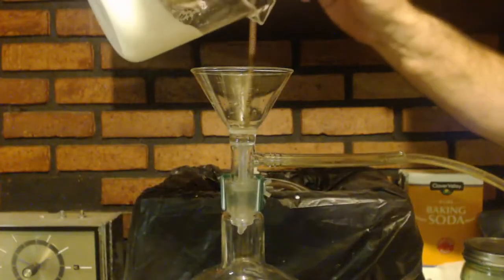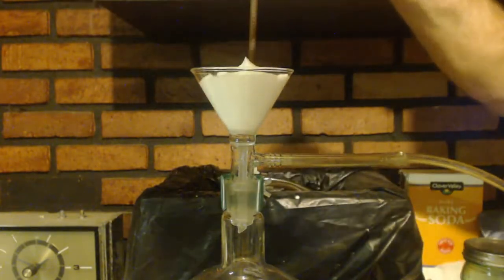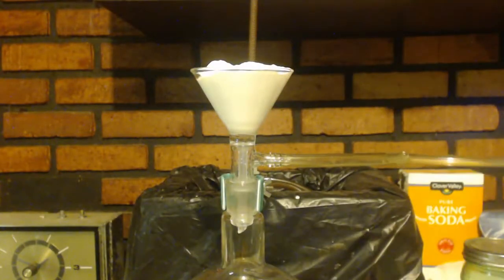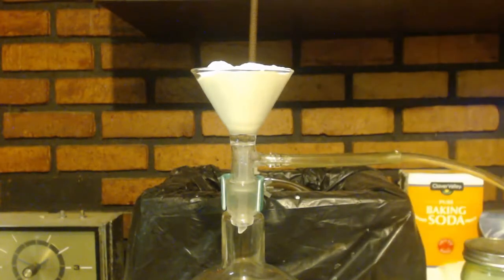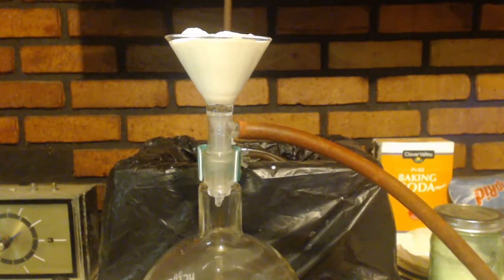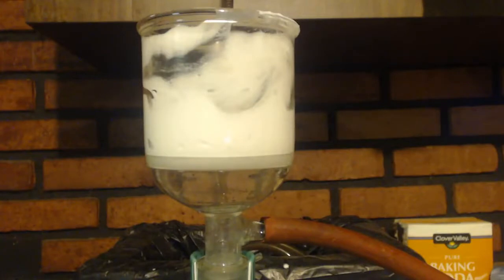So I'm just going to filter this out. Just going to get as much water as I can out of there. Switch to a bigger filter.